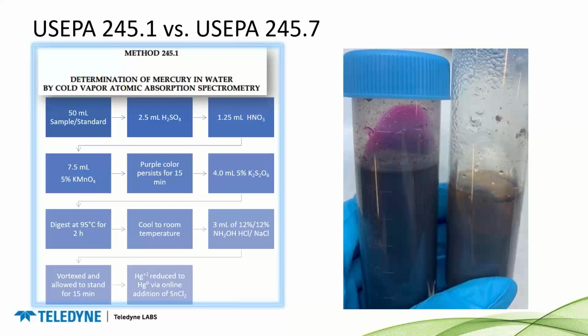So first, you'll take your 50 milliliters of sample and standard. In this method, the samples and standards are treated exactly the same. They are fully matrix matched, and they are digested together.